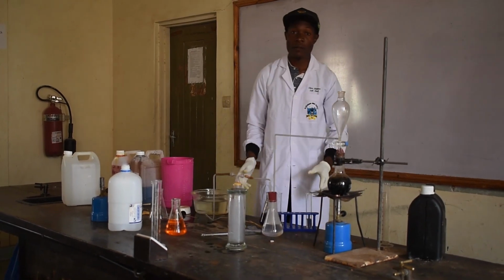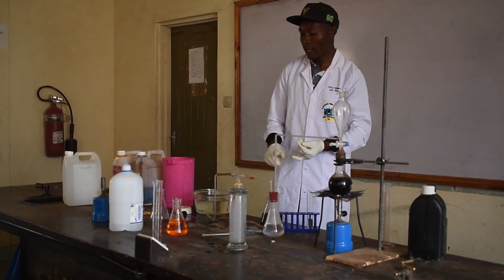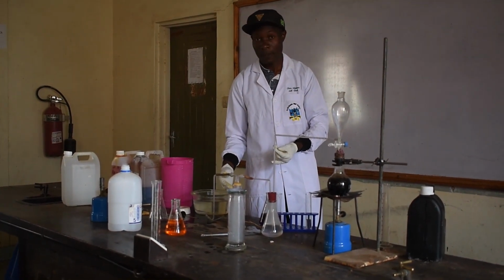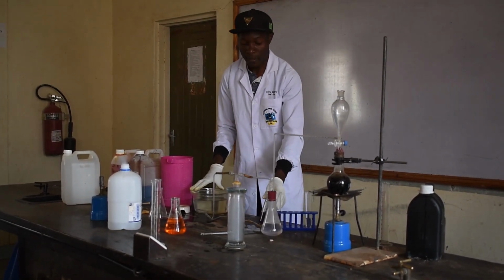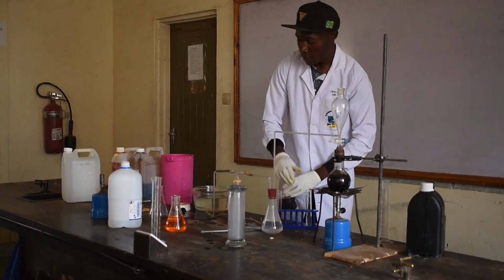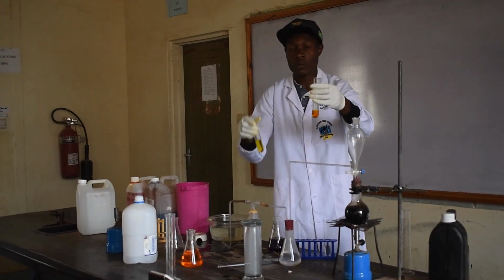Now, up to there, we have learned all the properties of ethene gas. First of all, we started with looking at the color of the gas, which is colorless. Then we smelled the gas, which is odorless. Next, we bubbled the gas through the potassium permanganate. It turned the purple color of potassium permanganate to colorless. We passed the gas through the potassium dichromate and it changed from orange to green.